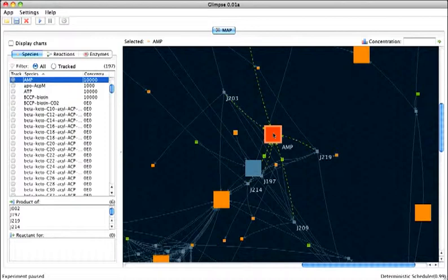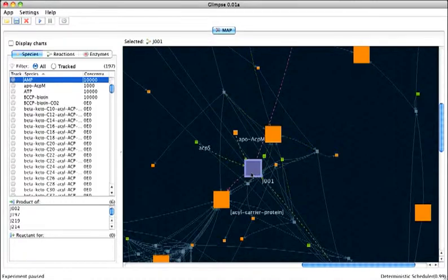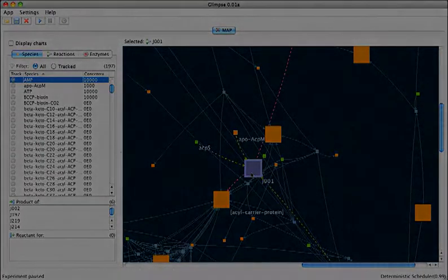When a node on the graph is selected, the names of the selected node and its neighbors are revealed. Green edges are drawn from predecessor nodes to the selected node, and pink edges are drawn from the selected node to its successor nodes. For example, if the selected node is a reaction, green edges connect the reactants to the selected reaction, and pink edges connect the selected reaction to its products.